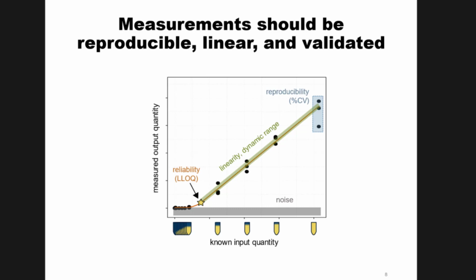This limit of quantitation is an example of a figure of merit. Doing the percent CV and the reproducibility can be a figure of merit. These are dependent on the peptide, the matrix you're analyzing, and the system you're using. So if you took the exact same sample and exact same calibration curve and did it on a triple quad versus an old ion trap, you would get different figures of merit because you've changed the analytical platform.